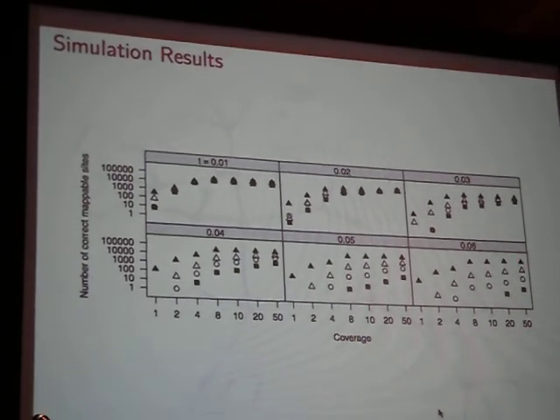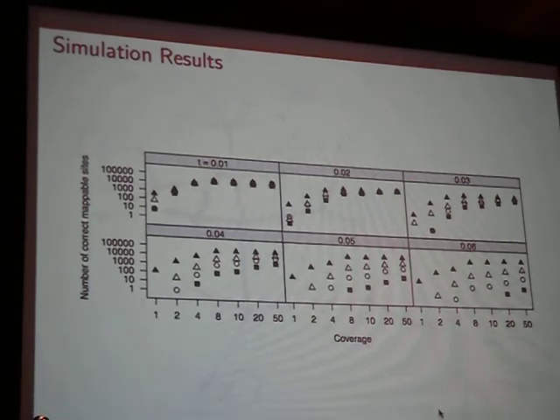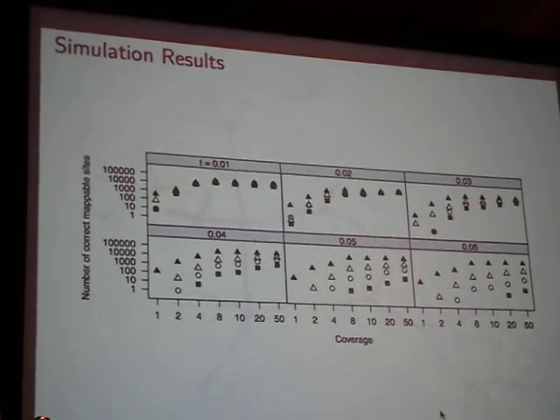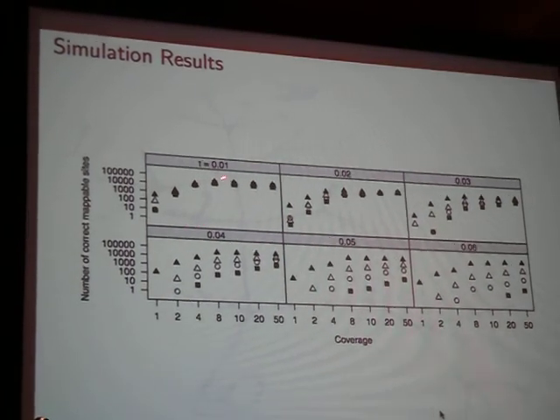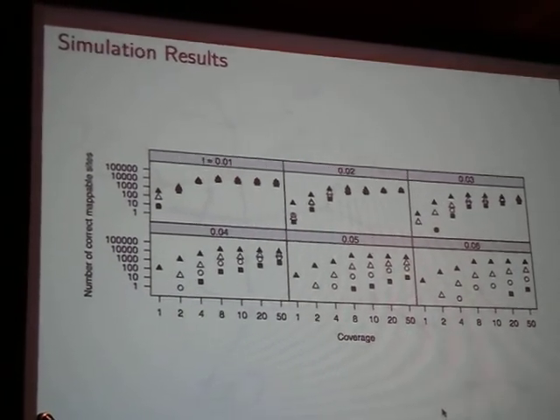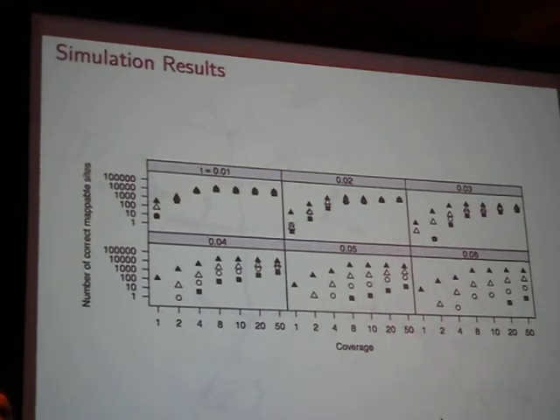So each of these are the 4 trees. But keep in mind that in a lot of cases, in most cases, you'll have some regions of the genome that are not highly diverged. So you will end up with good data sets. And all of these for the simulations are true positives, so we don't get any false positive data.